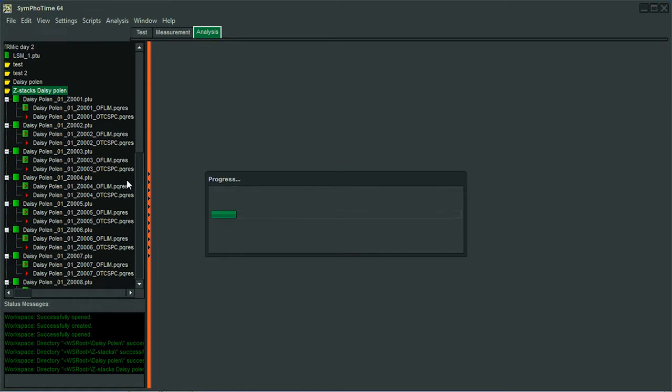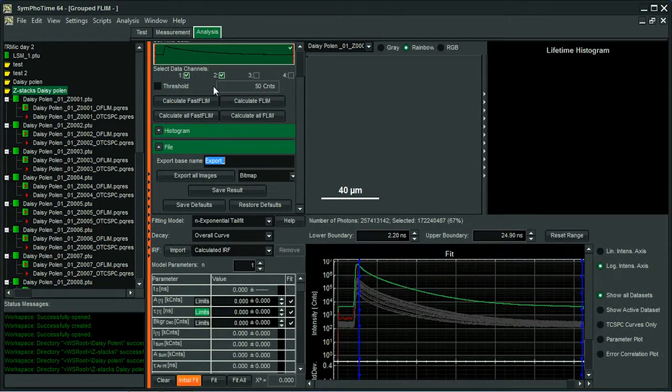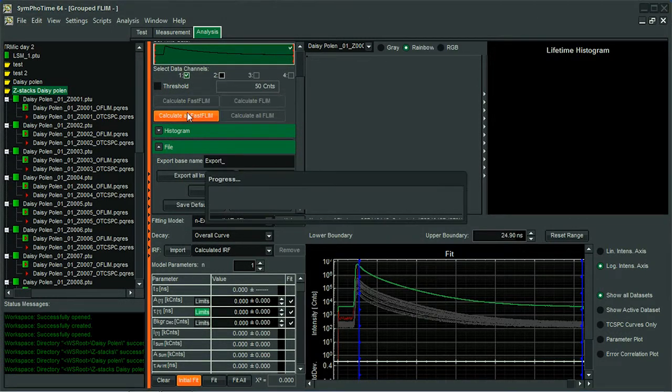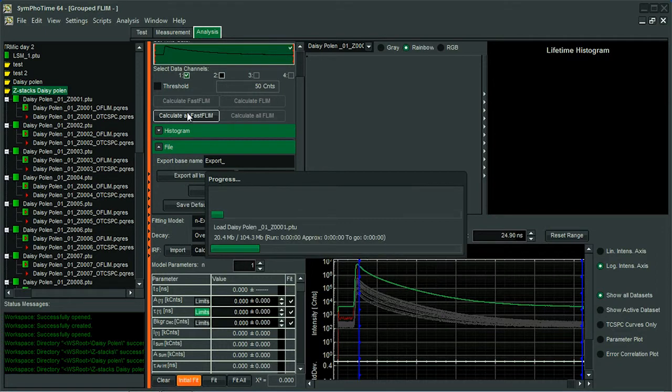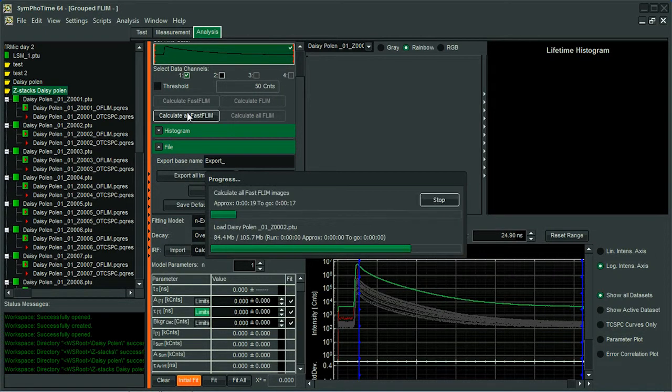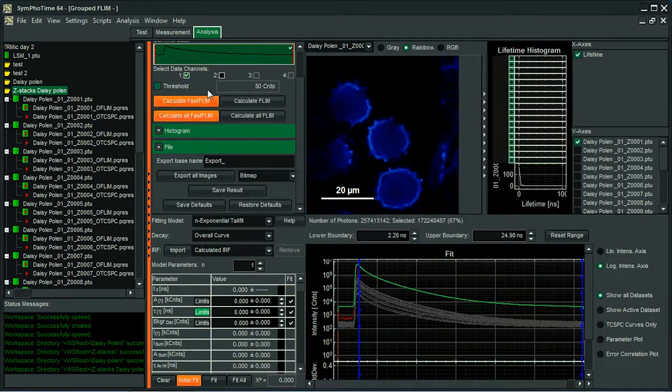So the images are being loaded, all 19 layers. And the first thing I do is to select the detector I want to work with. For example, in this case, channel 1. And I go to calculate the fast flint. Of course, this could also have been performed with the fitted flint.